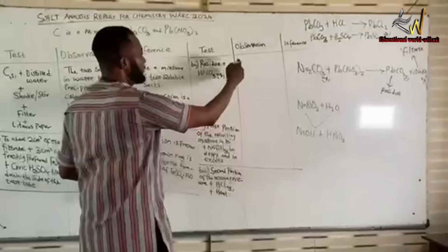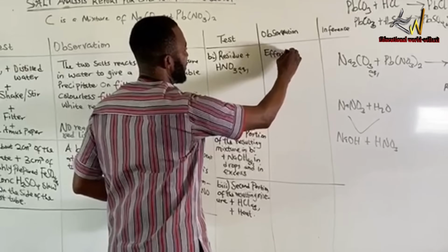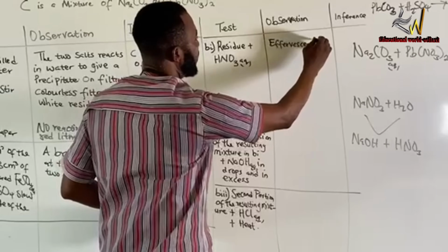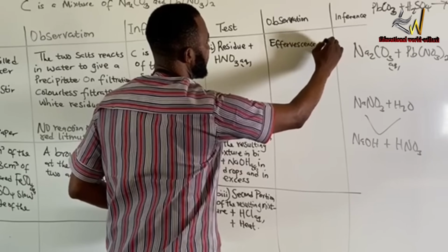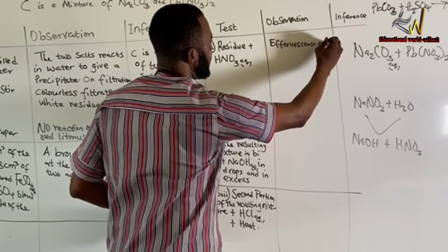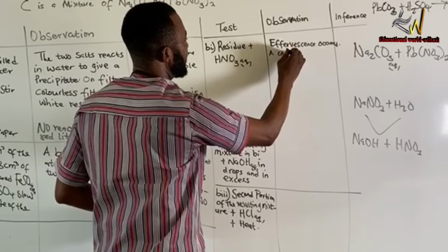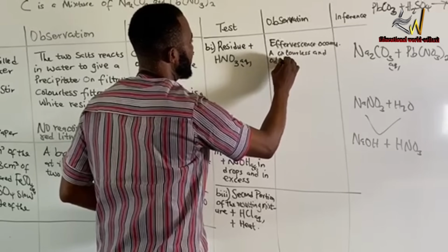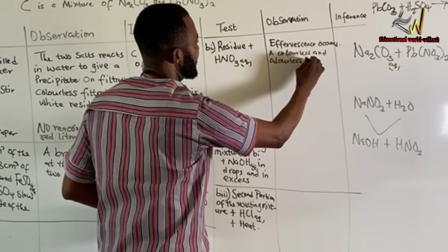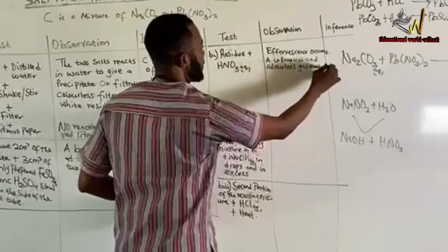All right, let's take down our observation. Our observation will be: effervescence occurred, then a colorless and odorless gas evolved.